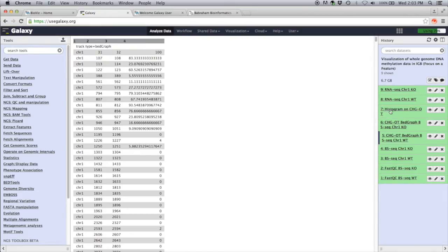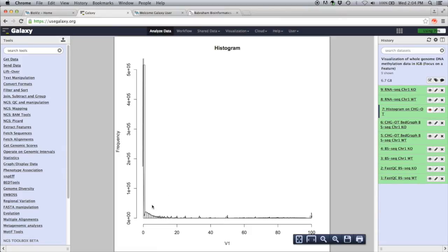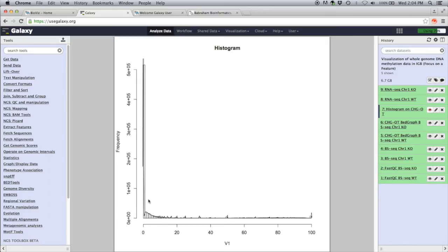We can get a feel for the distribution if we go to the histogram and click view data. This histogram shows the CHH context for the wild type, displaying where percent methylation values fall across all data points. The majority of data points fall at 0%, with a trailing peak in the 0–30% range. There's a small peak around 50% — possibly the heterozygosity effect — and then a bubble starting at 70% and a peak at 100%. Between 30 and 70 there's really not much data, which validates our 0–30 and 70–100 thresholding approach.